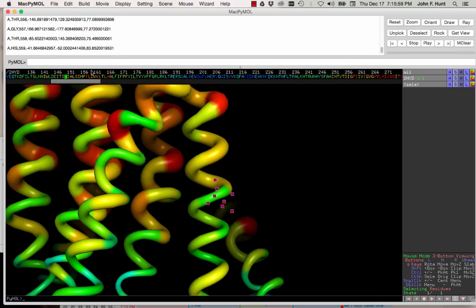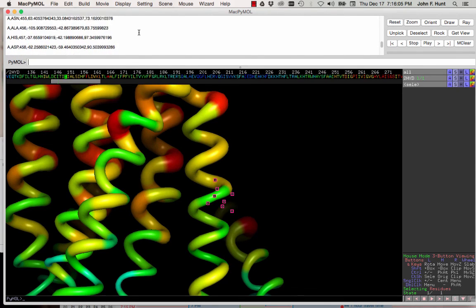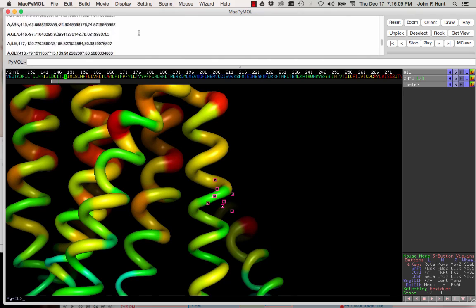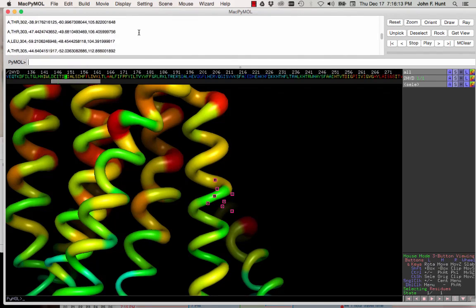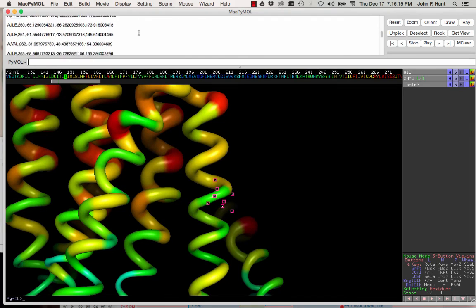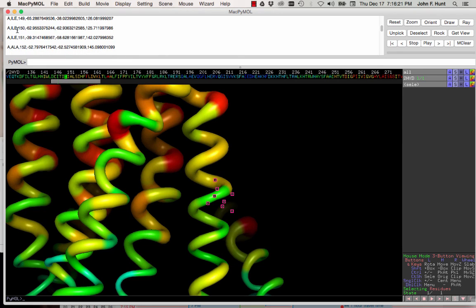Remember, we were looking at residue 150. Let's go up here and check that out. Do we get the right answer? Did we properly determine these Ramachandran angles visually, manually? Go back to residue 150. And what do we see? Yes, indeed, residue 150.